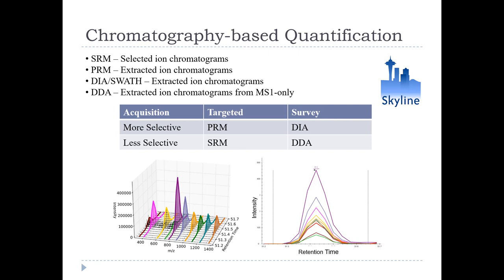And then finally, we were working with DIA from the perspective of doing identifications, and Mike had the idea, hey, let's try to extract chromatograms out of that data too. And then about 6 to 9 months later, the Aebersold lab presented SWATH at ASMS, and then things really took off, and that's where we are today.